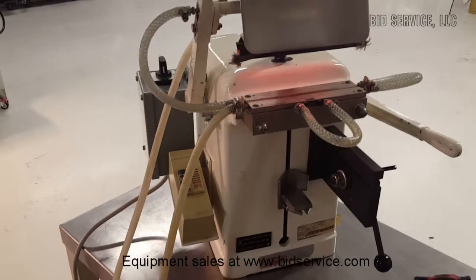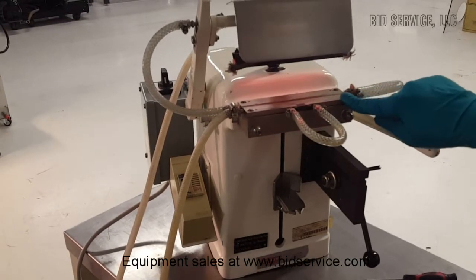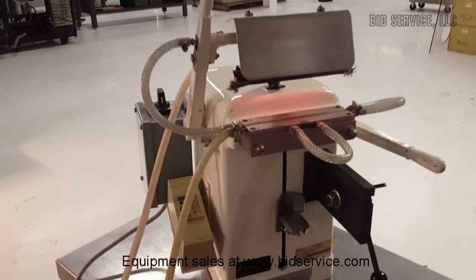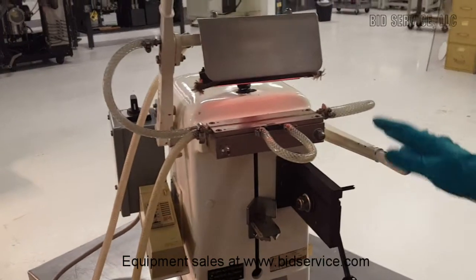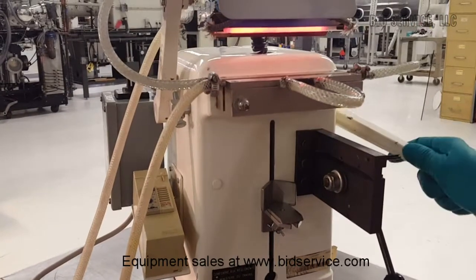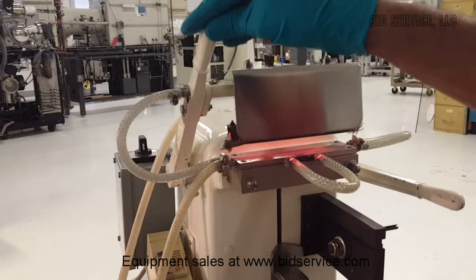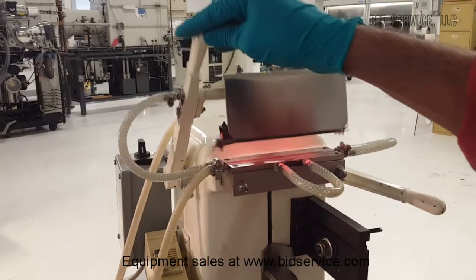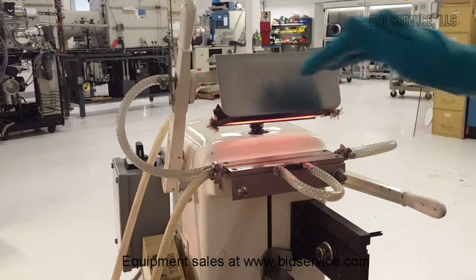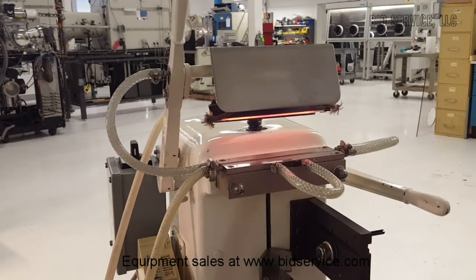So the system involves a pair of jaws and the radiating heat tube and the lever mechanisms to operate or to separate the jaws like that. And also there's another arm using the left hand we should adjust to lower the IR heating element over to the sealing jaw.